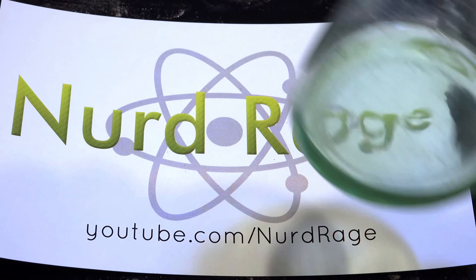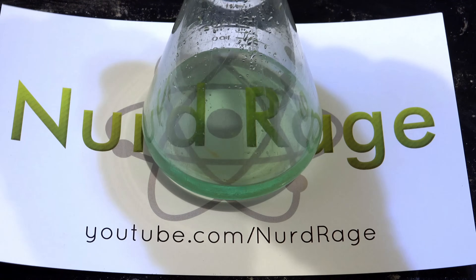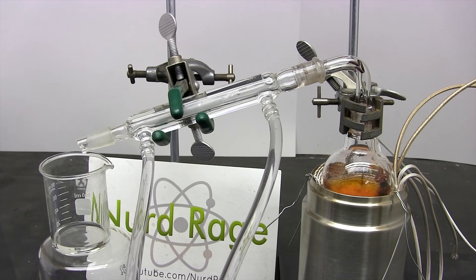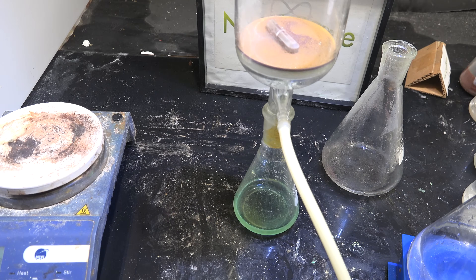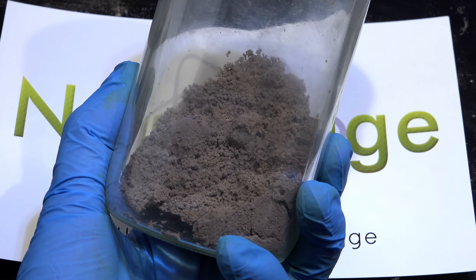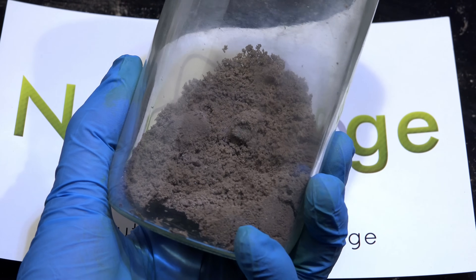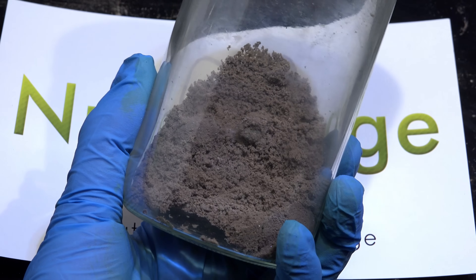And there we have it — sulfuric acid made by the copper chloride process. It's slightly bluish-green due to some minor copper contamination. If you want, you can distill the sulfuric acid using the high-temperature heating mantle I showed in an earlier video to get pure concentrated sulfuric acid. As for the copper salts and the bulk copper chloride from earlier, now that we've removed the sulfuric acid we can regenerate it again. Copper chloride will oxidize in air somewhat, so don't be surprised when it changes from white to a green, blue, or even brown color.